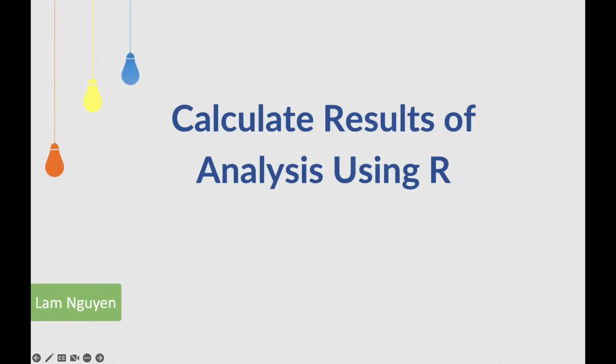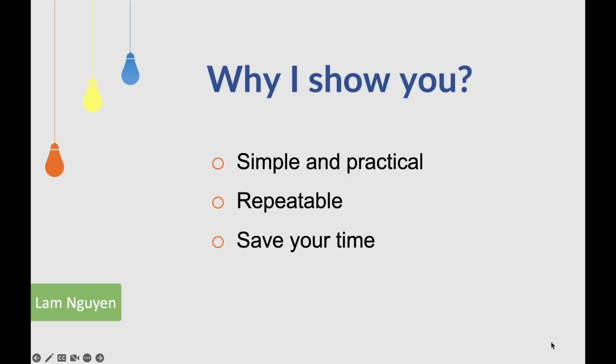Hello everyone. Today I would like to show you a very good way to calculate the result of analysis using R. The reason I would like to show you this way is because it is simple, practical, and repeatable, and it will save a lot of time.